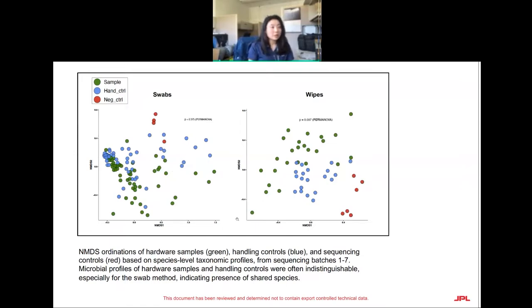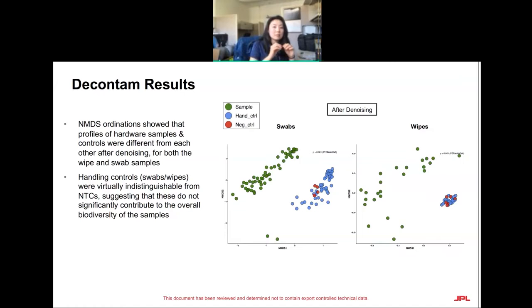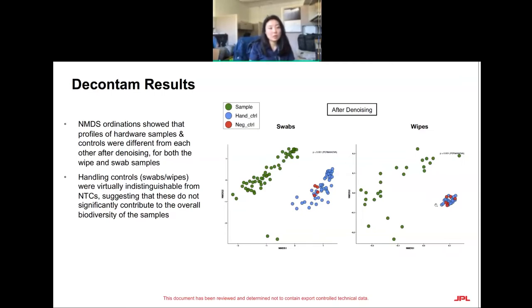Decontam is software that looks at the absence and presence of IDs within a sample and statistically removes contamination that is present consistently across many samples and across controls — identifying what's showing up consistently and removing it from our actual samples. After applying decontam, our samples, handling controls, and negative controls no longer overlapped.